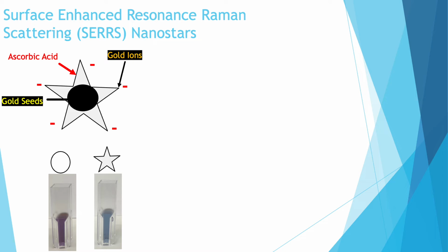On the UV spectrum, a star shape, which is more what we want again, is associated with a visibly blue color, while a circular shape will be more red. So these are two separate batches of nanostars. This blue batch is going to be composed of more hard-shaped stars, whereas this more purple-looking batch is going to have rounder edges like a circle.